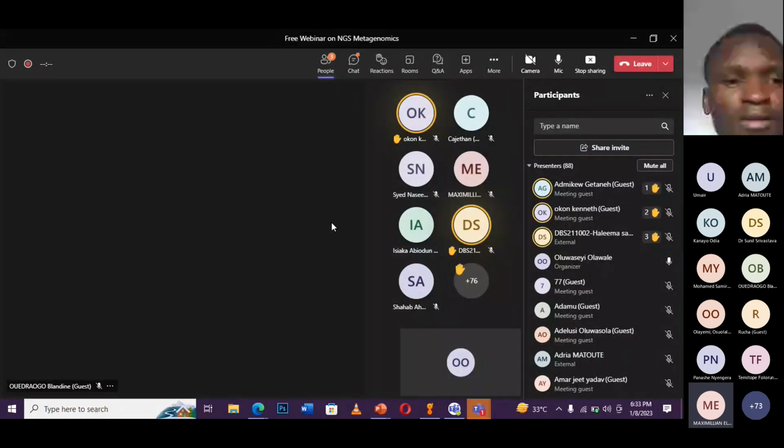I would suggest you do ITS sequence. ITS sequence is Sanger sequencing targeted towards a specific gene, and it's not costly. If you are from Nigeria, it should cost you around maybe 20,000 or 50,000 naira. Then you do molecular identification through BLAST on the NCBI database, and you will know the name. I'm just giving you the practical workflow. Do you understand? It's very cheap.